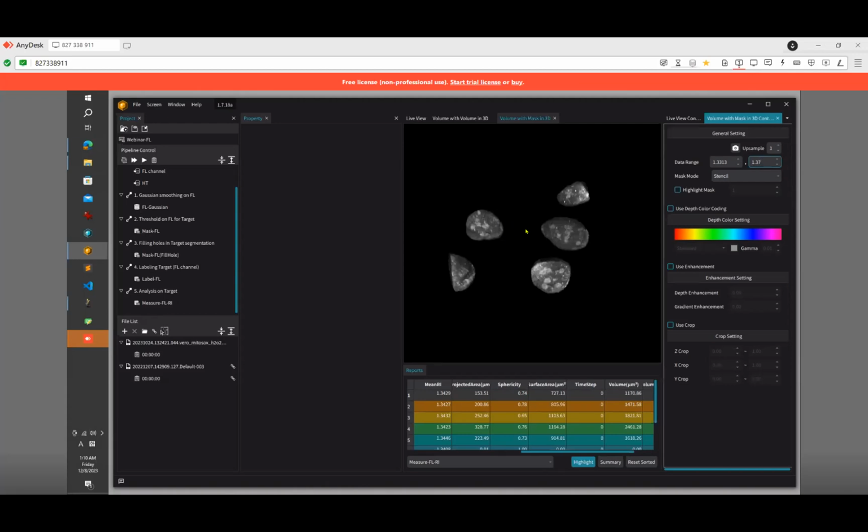So here, I use the mask, identify the thresholding, and apply the mask on the HT data. So you can see here the nucleus only, which is identified from the fluorescence. And you can overlap these nucleus images onto the background as well. If you modify the pipeline, it's possible.